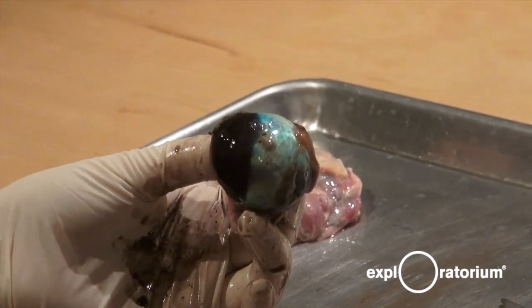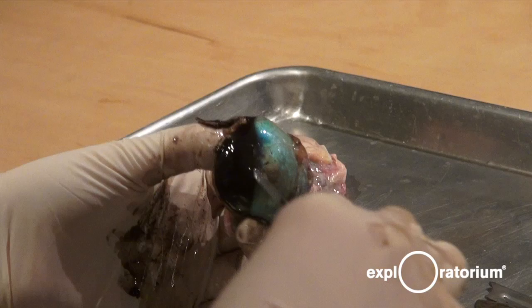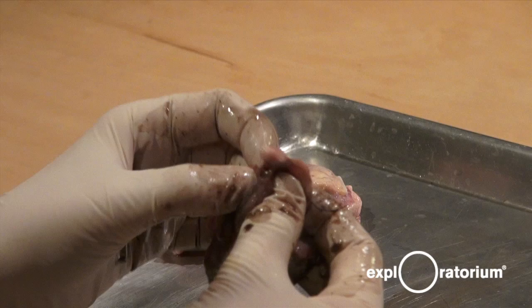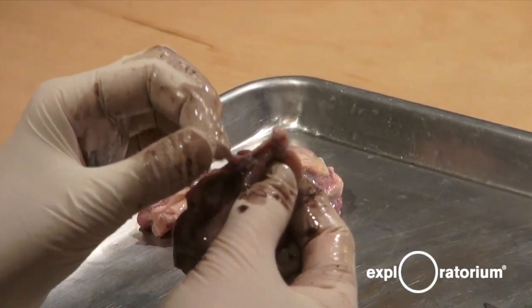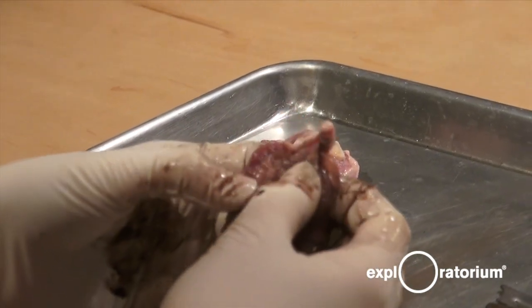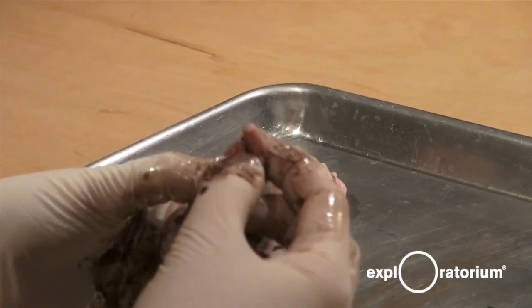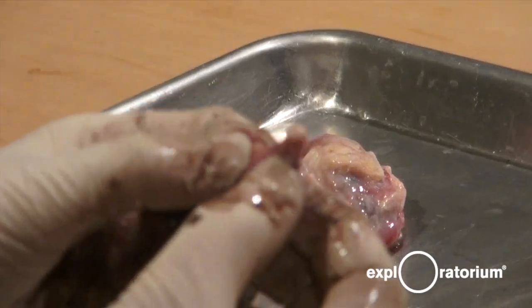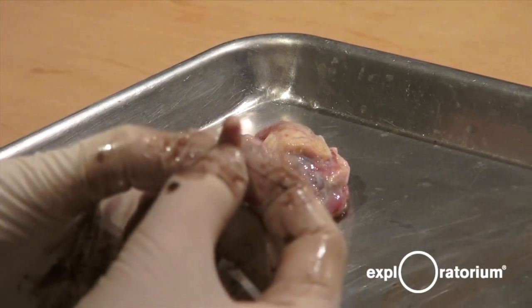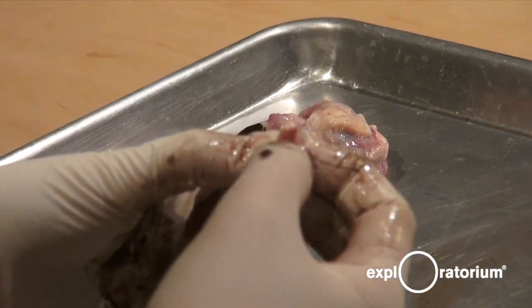The retina cells are connected through the optic disc to the optic nerve, which is connected to the brain — it goes all the way to the back of the brain where it's called the visual cortex. If you got hit in the back of the head hard enough, you would not be able to see because the visual processing part of your brain would no longer work. We have 1.2 million fibers in this optic nerve — very tiny and there are a lot of them. This is why we don't give eye transplants, because if a doctor was trying to connect all 1.2 million fibers, they would take their entire lifetime, and they're microscopic.